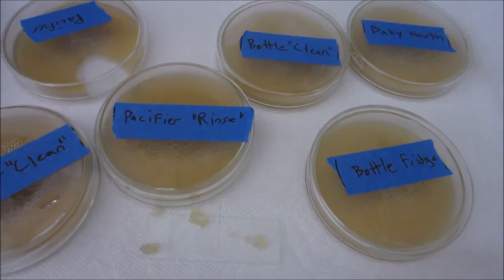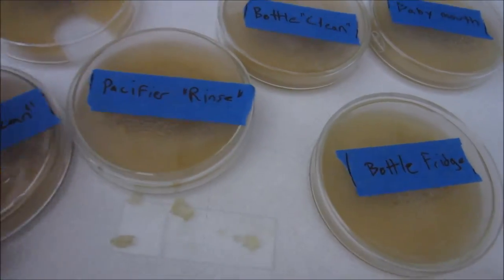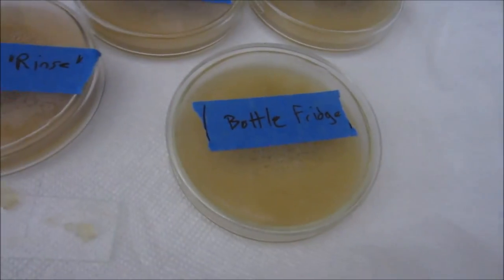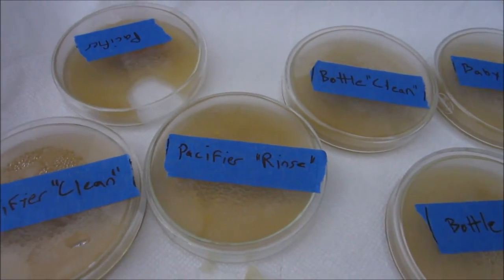If I was to draw some kind of general conclusion, I would say that smooth textures of plastics and silicone seem to be a lot better in terms of sterilization and lack of microbial retention. So you may want to consider using products that are smooth on their surface.